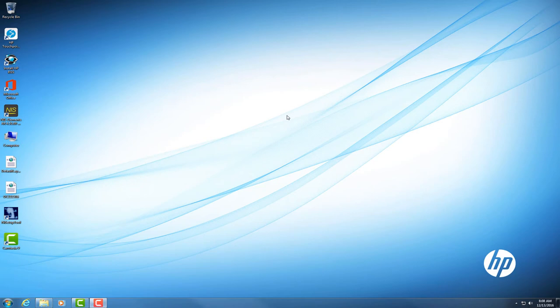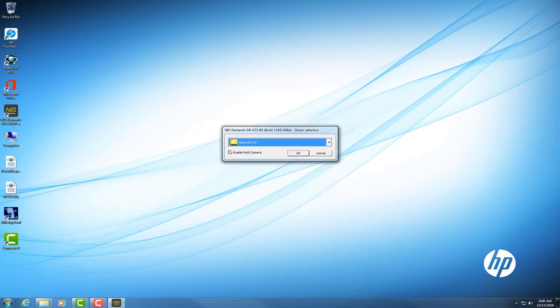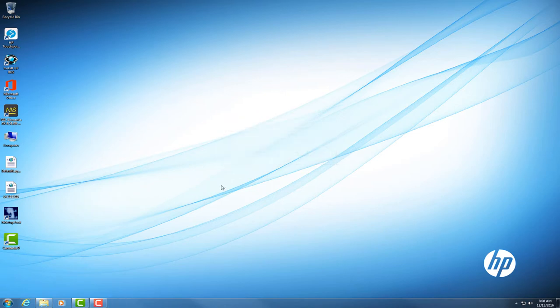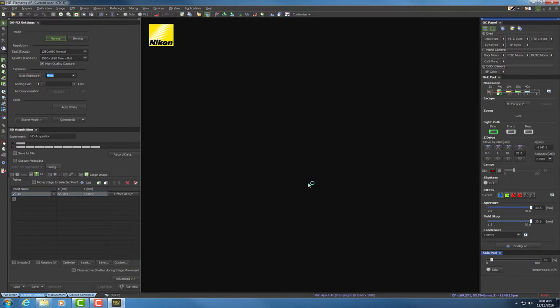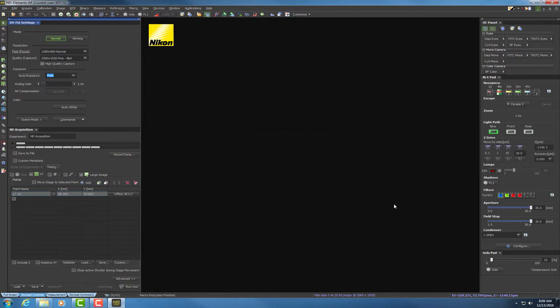Welcome to this tutorial on using the Nikon Brightfield microscope to take pictures of H&E and Alcyon Blue stain slides. We're going to start by opening Nikon Elements on the desktop. Once it opens, we're going to select the Nikon DS U3 and hit OK. You'll get a dialog saying the optical configuration was successfully finished — just hit OK. This is the desktop we'll use to control all of our settings.